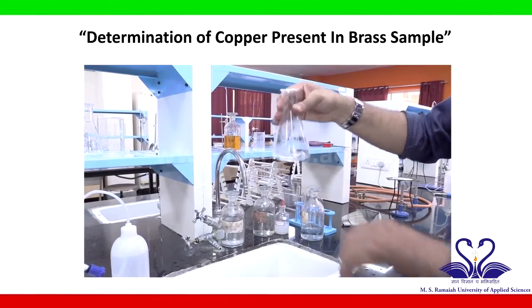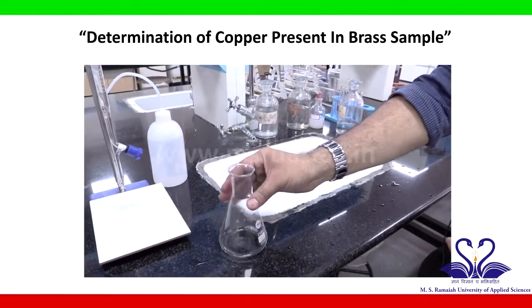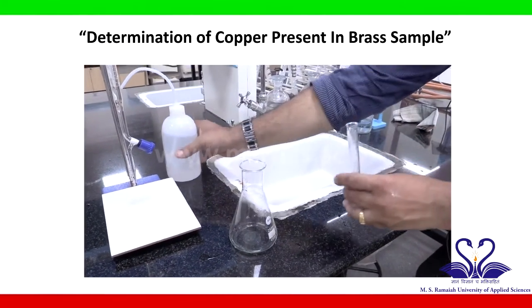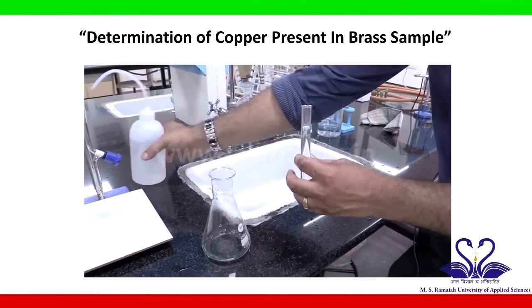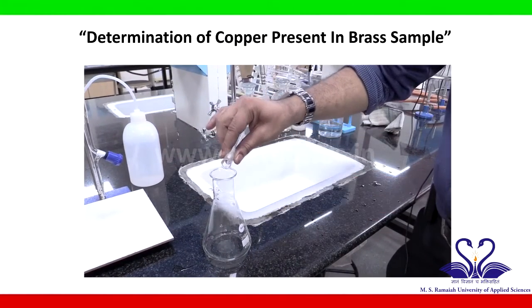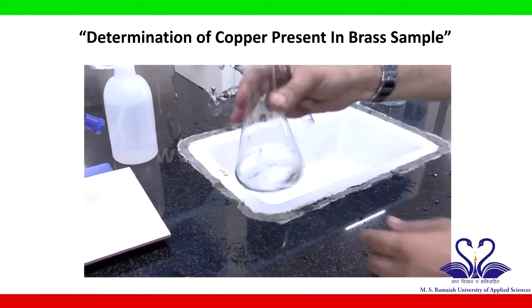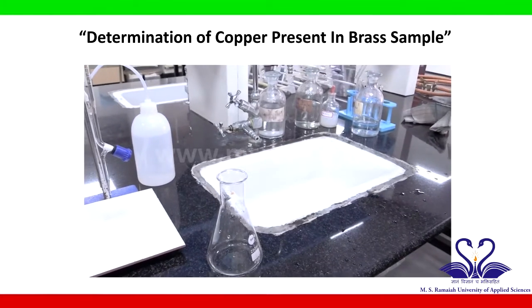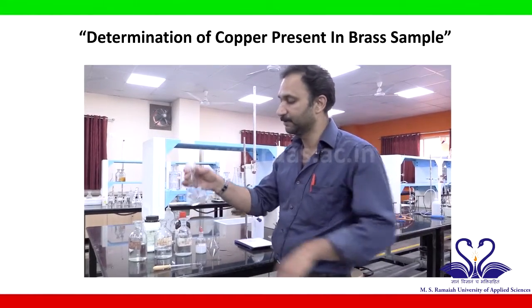Now it is cooled down. Ensure thorough cooling by adding 1 more test tube of water. Now the solution has been completely cooled.